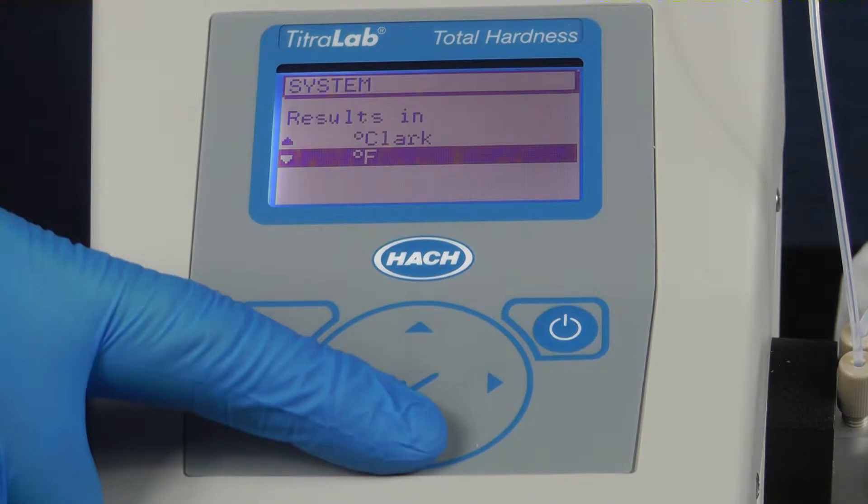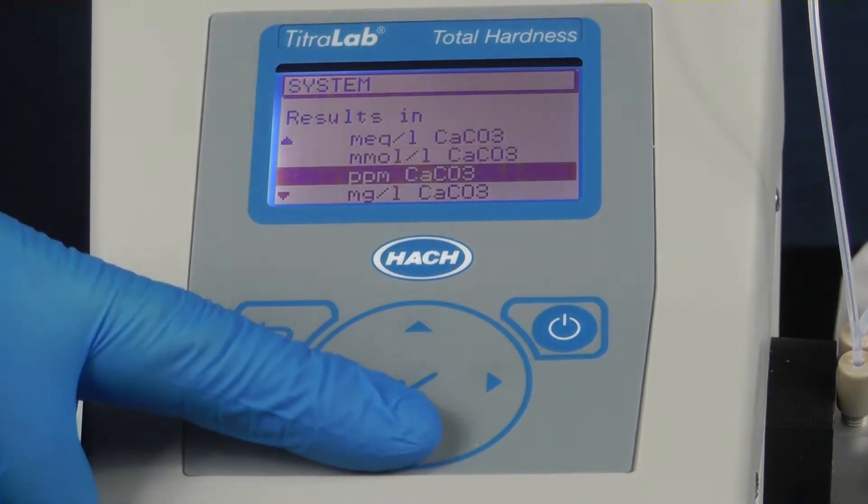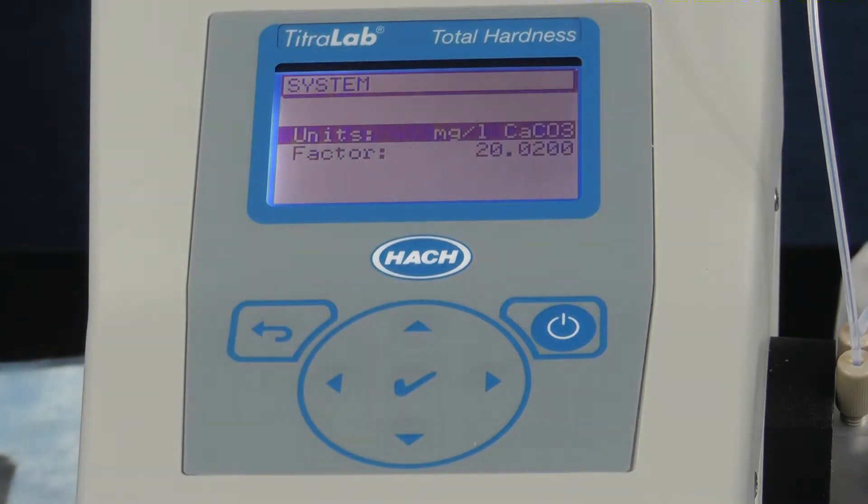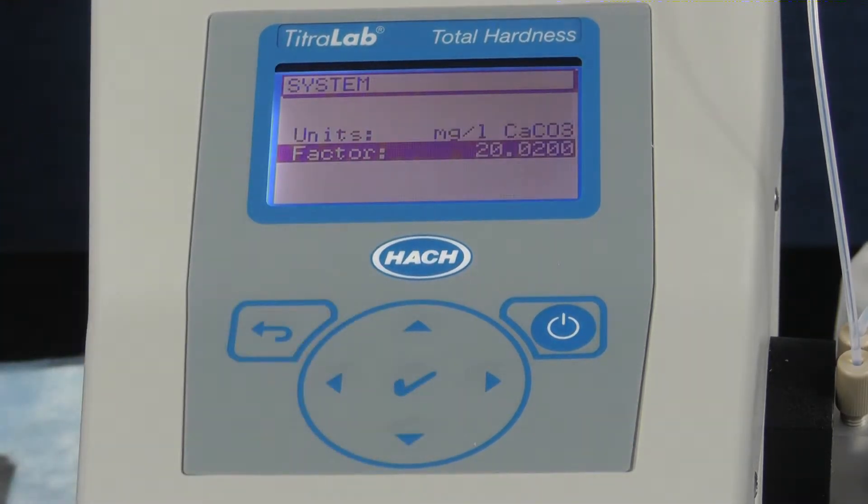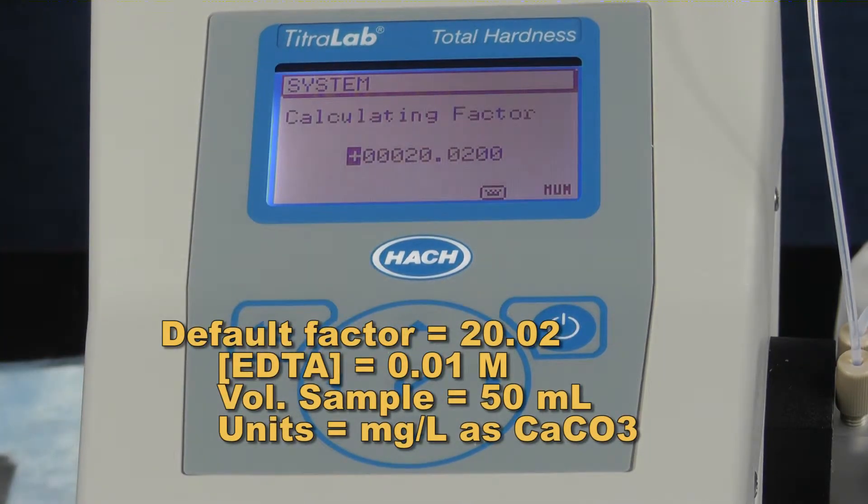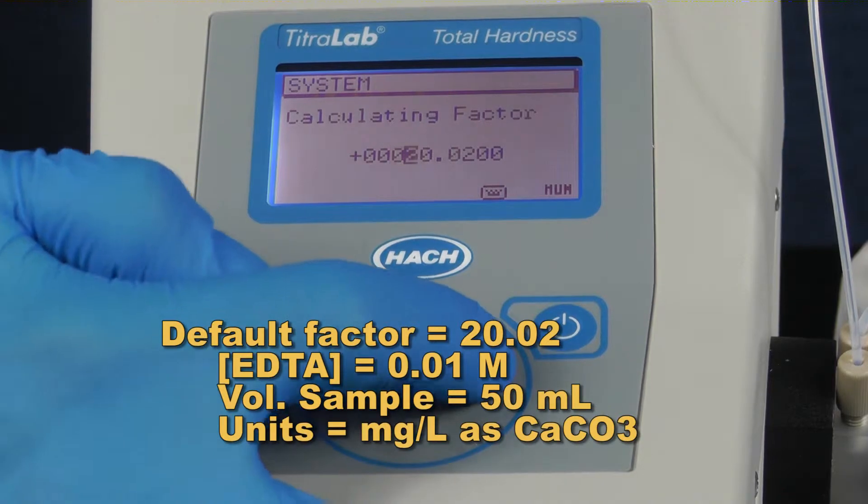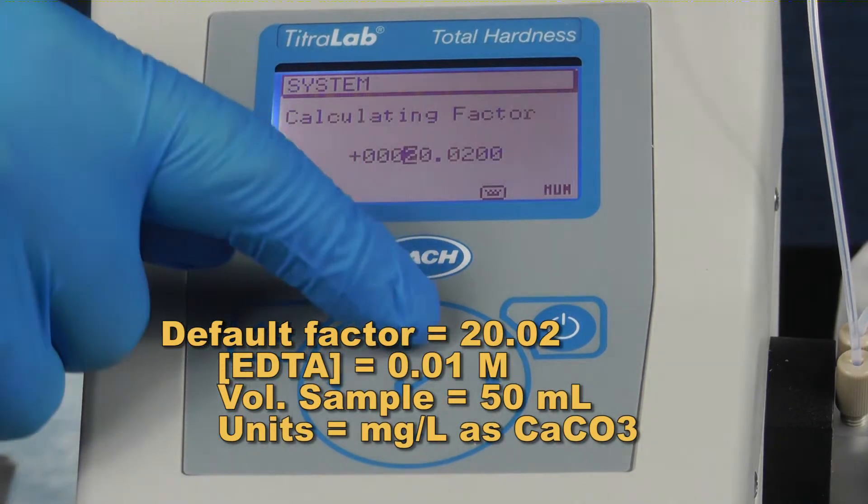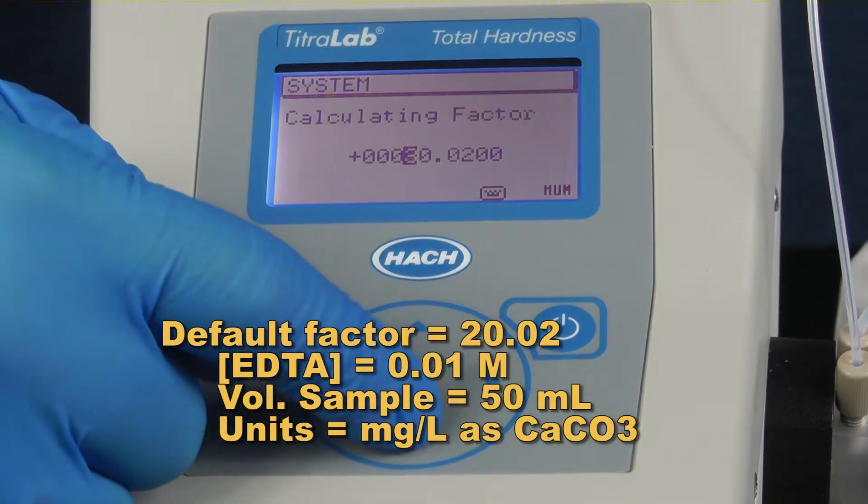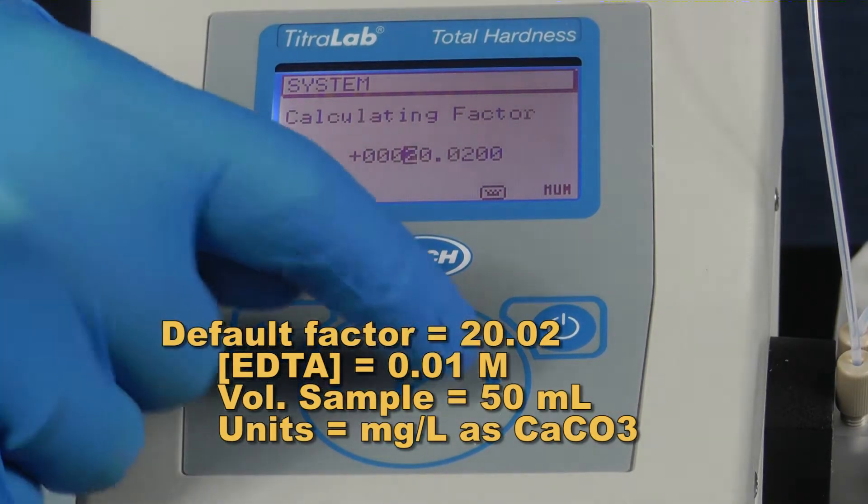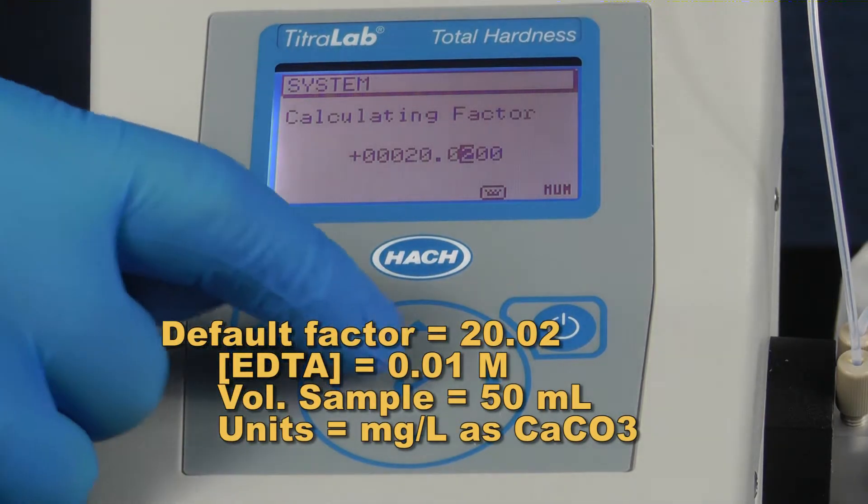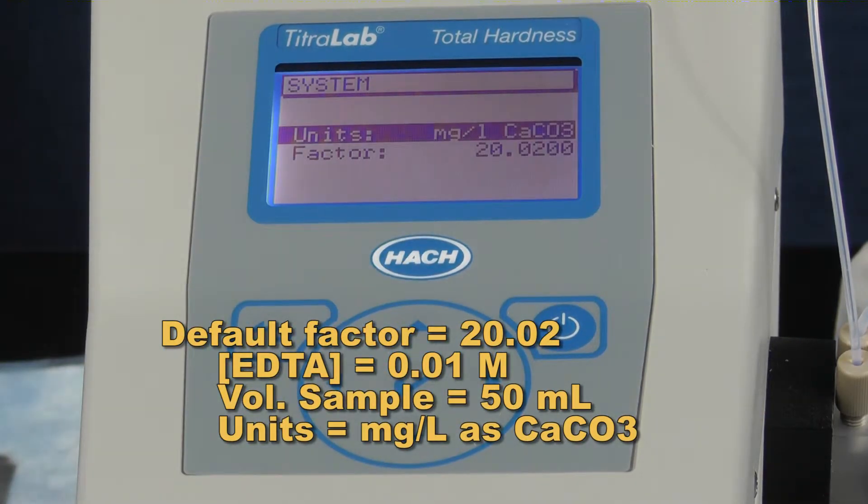If you need to change the results factor for your results due to a change in titrant or volume of sample, select factor. Use the right and left arrow keys to scroll over to the digit and press the up and down arrows to scroll through the correct number. Press the check button to return to the previous screen and the return button twice to return to the main menu.